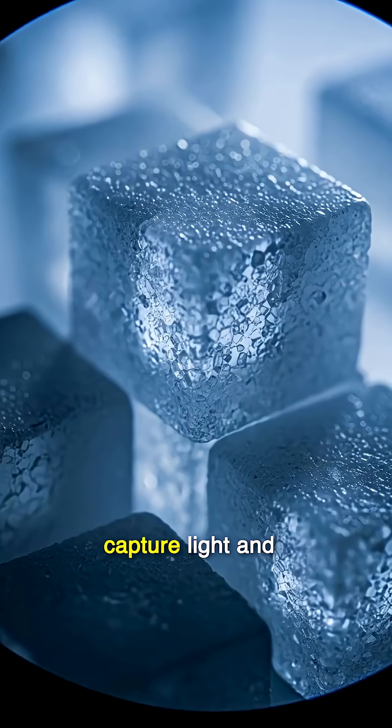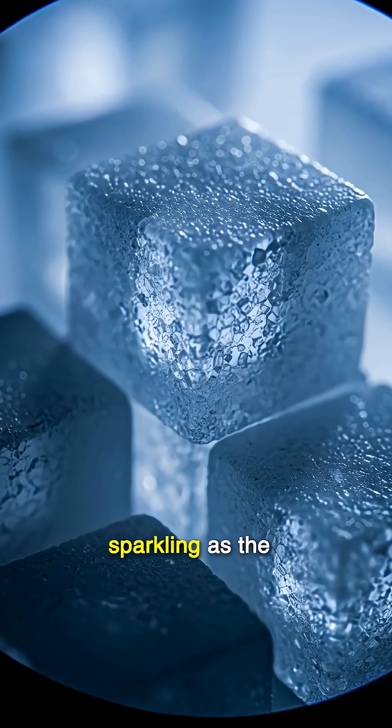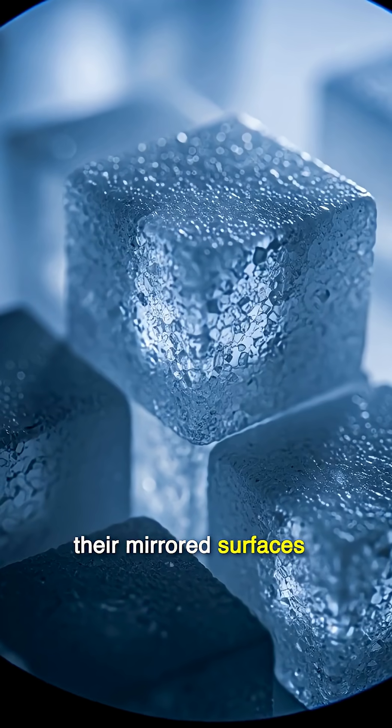Magnified, these cubes capture light and softly glow. Their faces shimmer, sparkling as the camera sweeps across their mirrored surfaces.